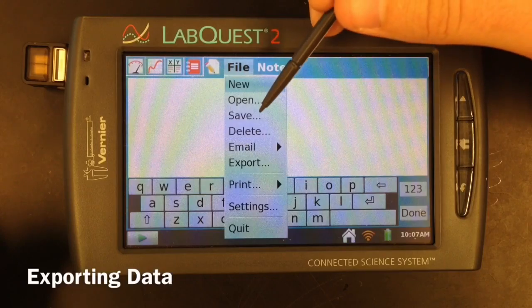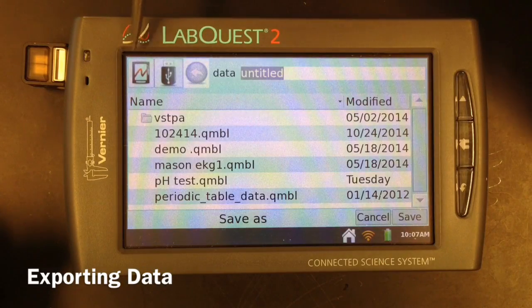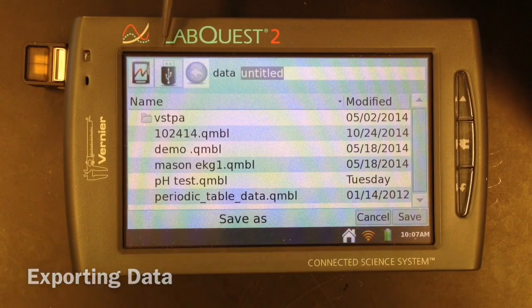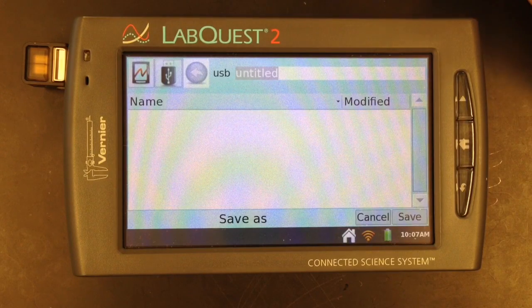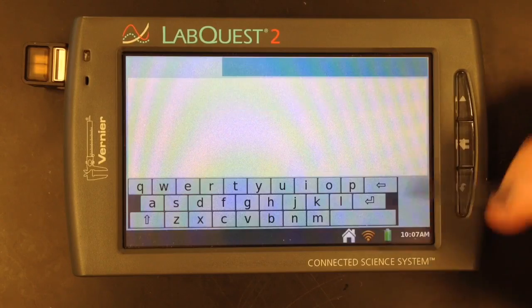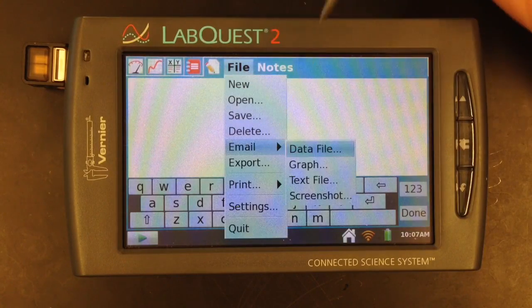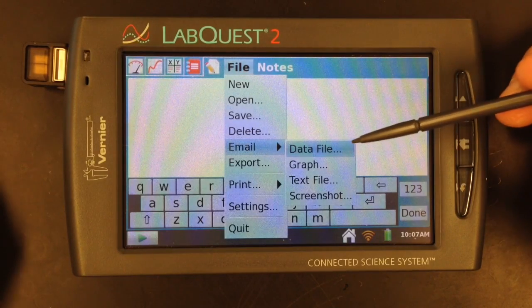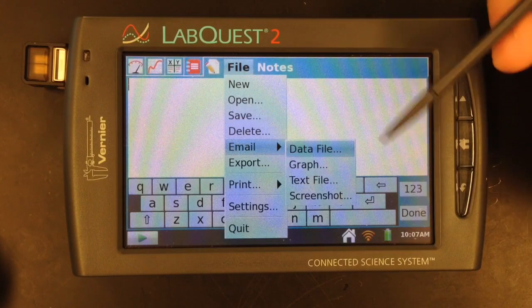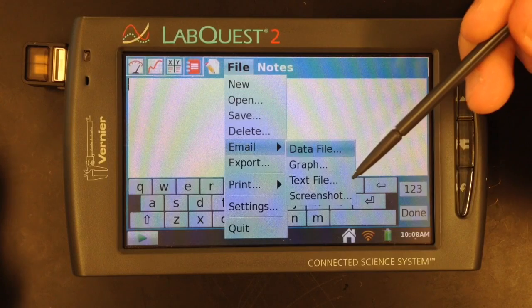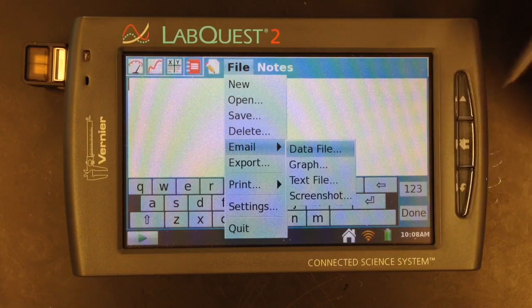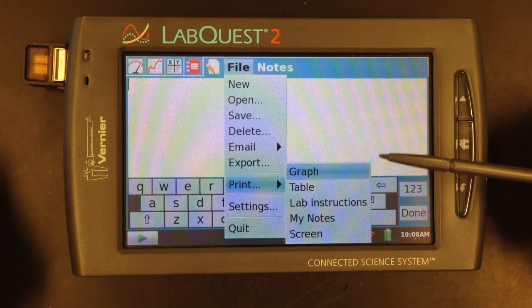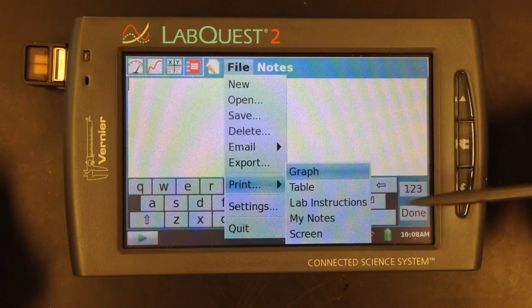Under the file menu, if you want to save your data, you have a few options. The tabs along the top show you where you're saving it — directly to the LabQuest 2, to a flash drive, or to a micro SD card. You're also able to email your information to yourself or your entire lab group. You can save the file to be opened in Logger Lite on your computer, save just an image of the graph, a text file which can be imported into Excel, a screenshot of the entire device, or send a graph or data table image to one of the printers in the office.